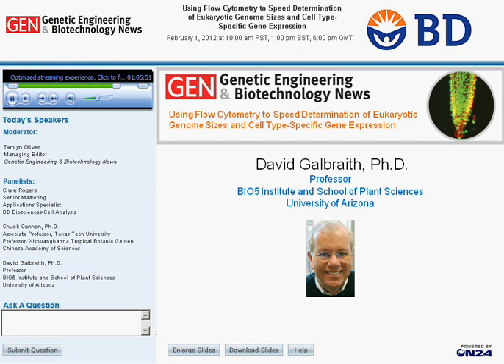Okay, here's another question. Have you ever worked with any of the Vybrant DyeCycle dyes from Life Technologies and Invitrogen, and would these be similar to the PI dye that you used for your studies? The answer there is no, we haven't, but they sound to be interesting dyes.